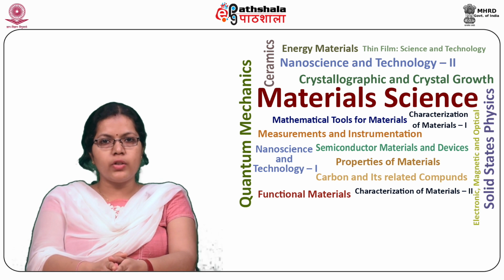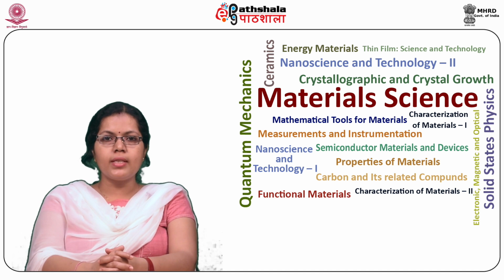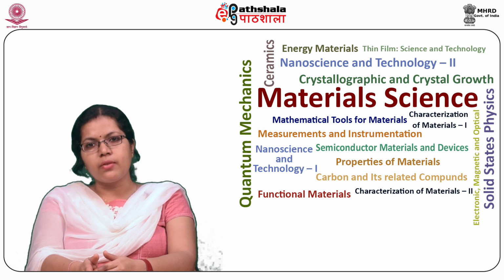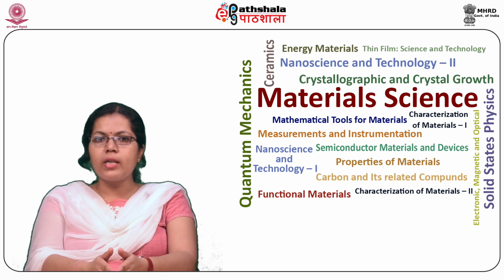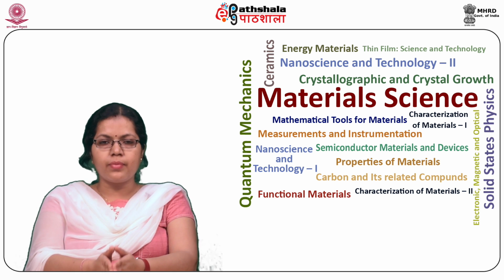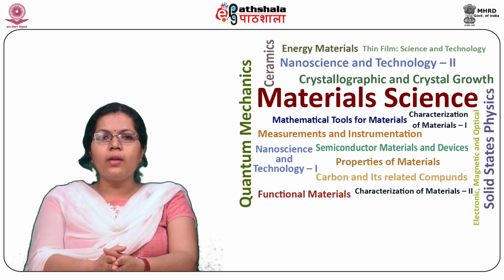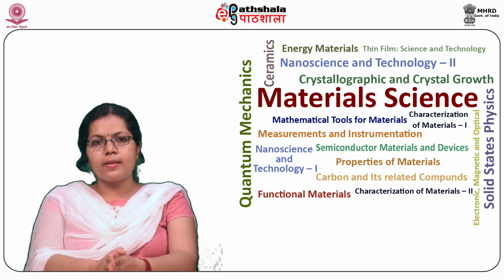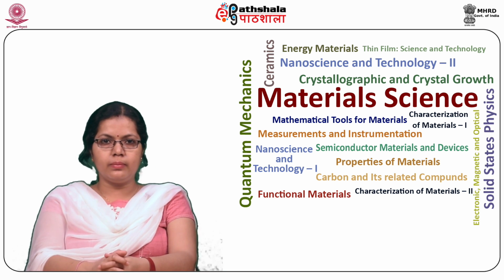The photomultiplier tube is the extensively used detector in UV-vis instruments. It includes a photoemissive cathode, that is, electrons are emitted from the cathode when photons strike it, several dynodes, where a dynode emits multiple electrons when one electron strikes it, and an anode.